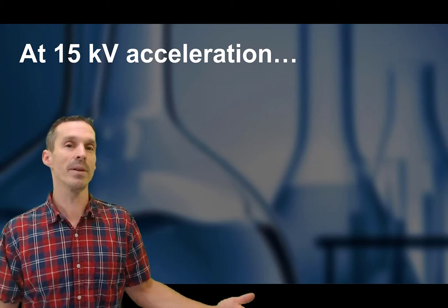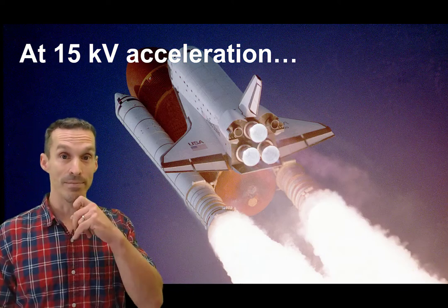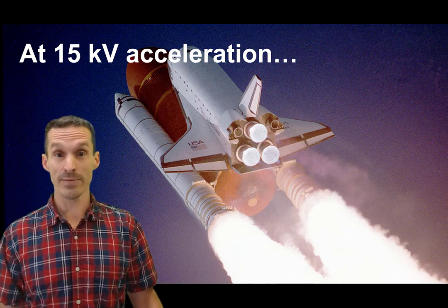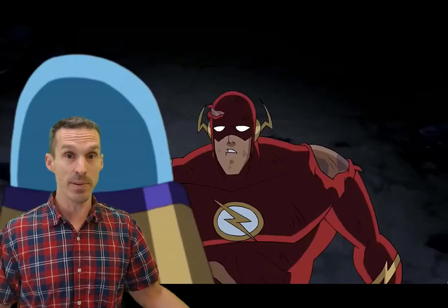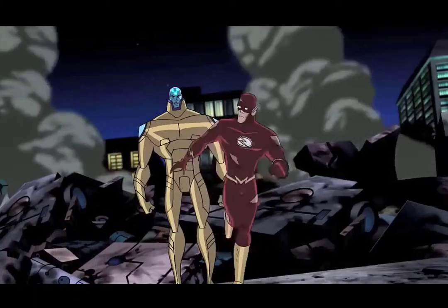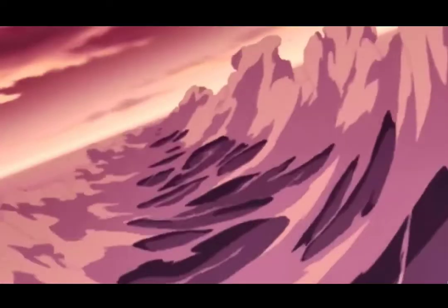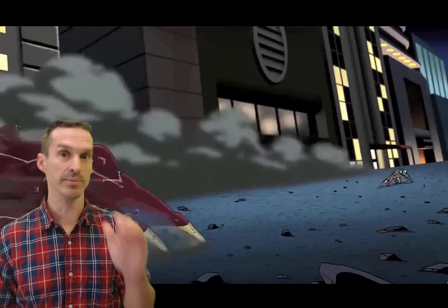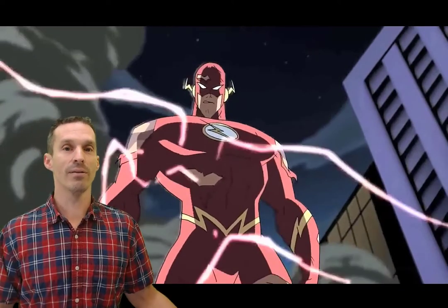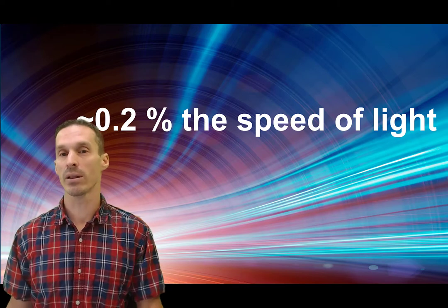So the question is, how fast is it? Well, I put some comparisons out there. Is it as fast as a jet? Yeah, it actually is. How about a rocket ship flying out in outer space? It's faster than that. All right, the Earth orbiting around the Sun. Actually, it's faster than that too. This is the best way to compare. How fast are we talking about? He's running around the world. Yeah, kind of that fast. When we compare it to the speed of light, it's like 0.2% of the speed of light. So these ions are moving extremely quickly through the flight tube.